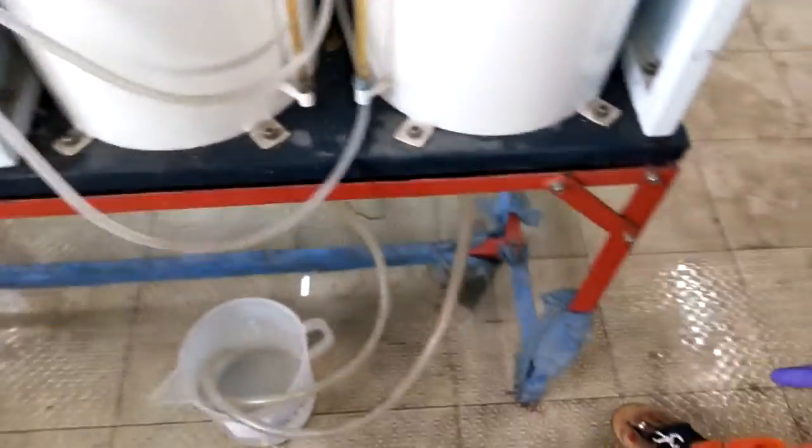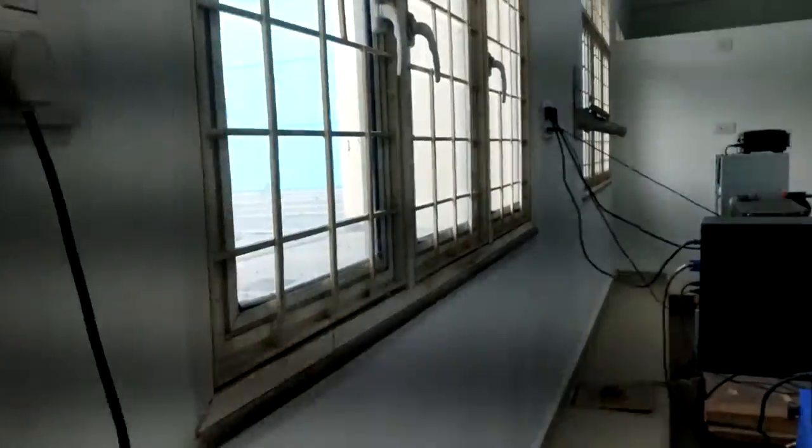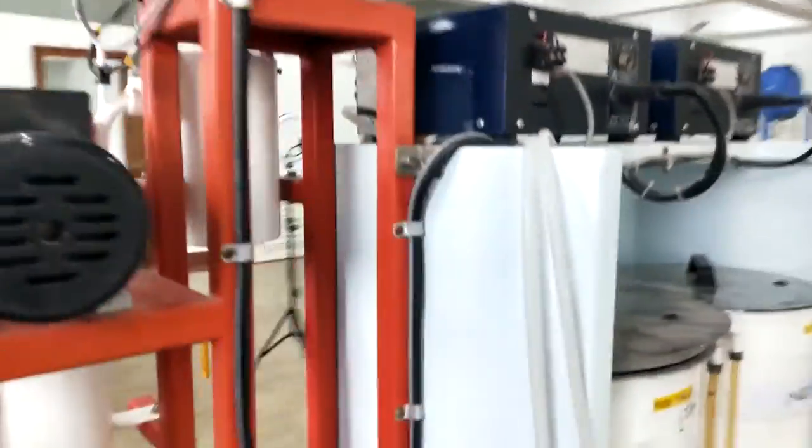So the chemical smell will be there, so wear a mask. Okay. So once done, switch off the main switch. Now we will see the observation and calculation part.